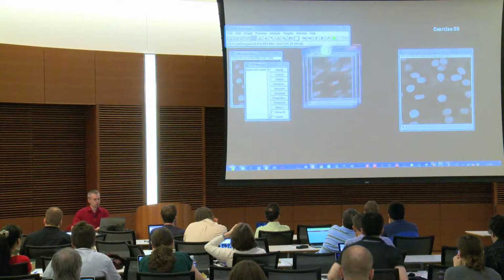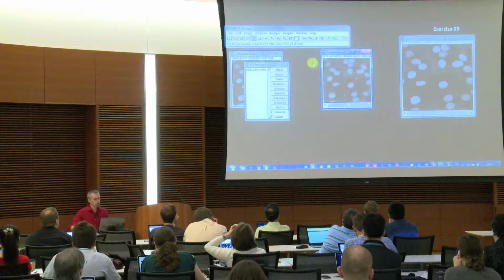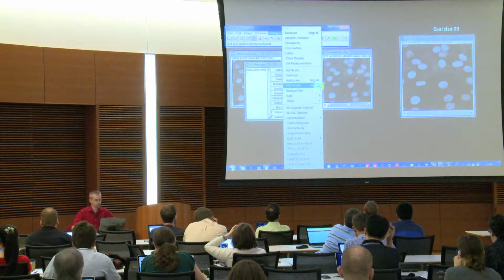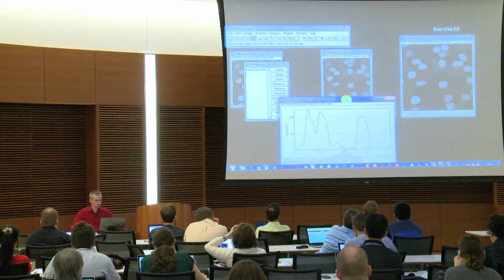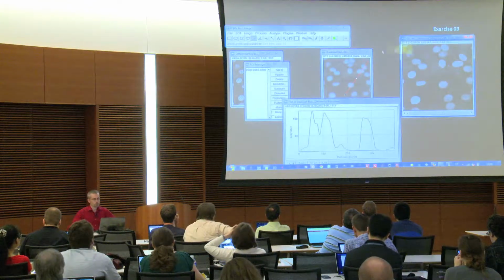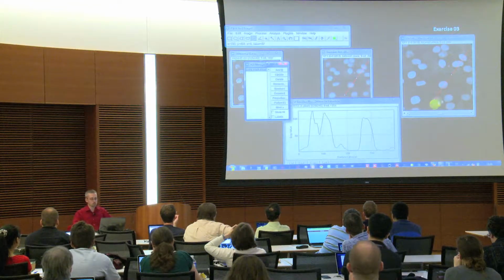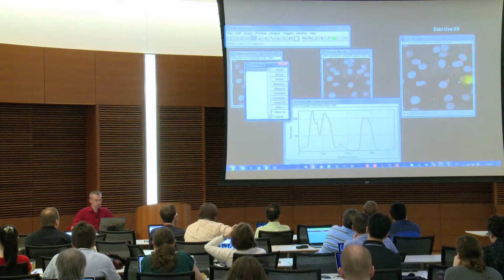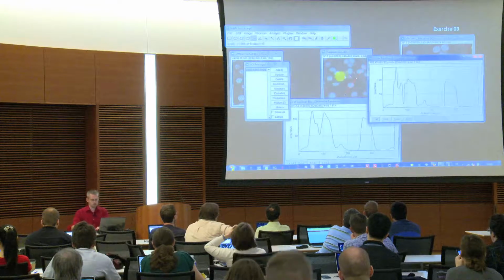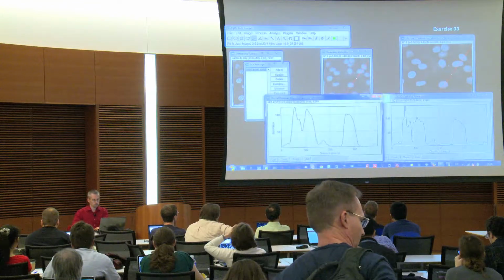And then what we can do is with this line, we can simply make a plot profile under Analyze Plot Profile or simply press K. So now if we go to the other image here and click on the entry in the ROI manager, this line is transferred to exactly the same slide in the same position. So and here, if we go to Analyze Plot Profile, we get this one. So you see it's slightly different.